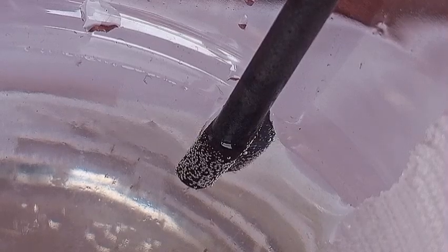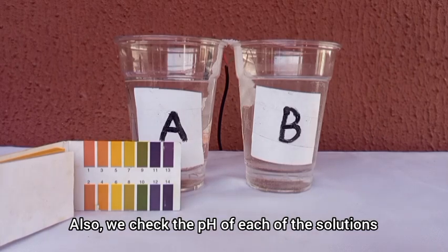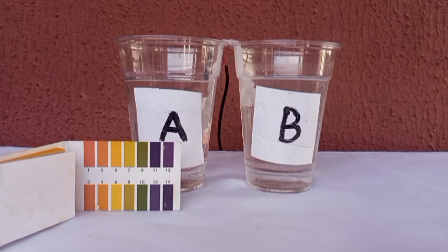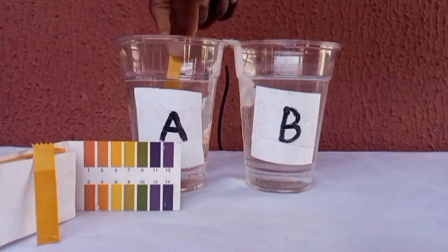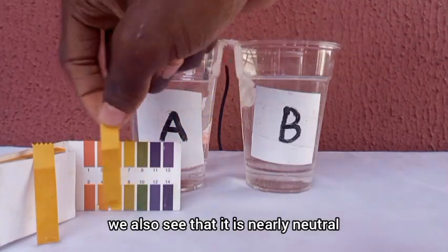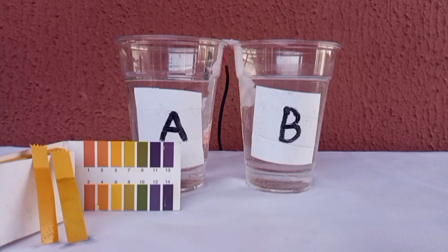We check the pH of each solution at the start of the experiment. Checking the pH for solution B, we see that it is nearly neutral, and checking the pH for solution A we also see that it is nearly neutral. Now we leave the electrolysis to run for about an hour and come back to check on it.